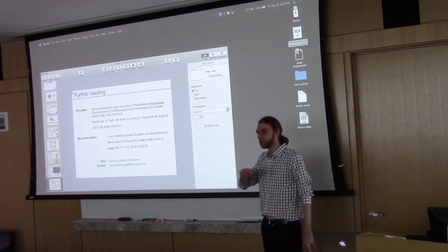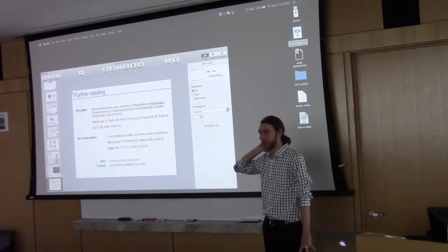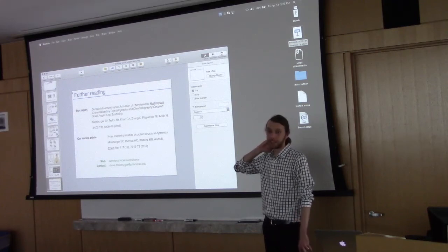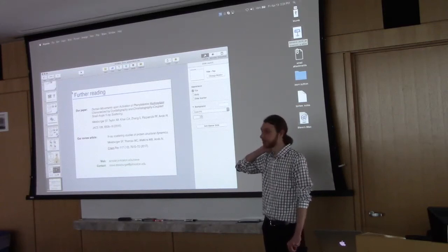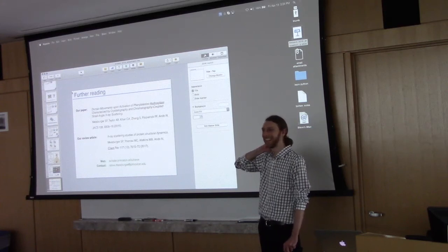Emery Brookes' program assumes that peaks have a Gaussian shape, so he fits Gaussians to the elution peaks. And then there's another program, whose name I'm blanking on, that uses the Guinier and assumes a linear Guinier, which is not always a good assumption.